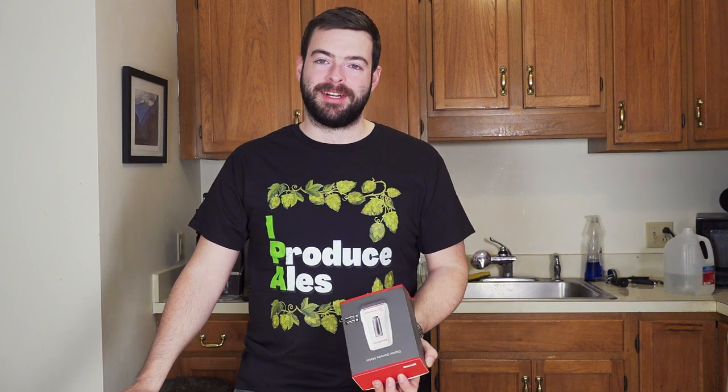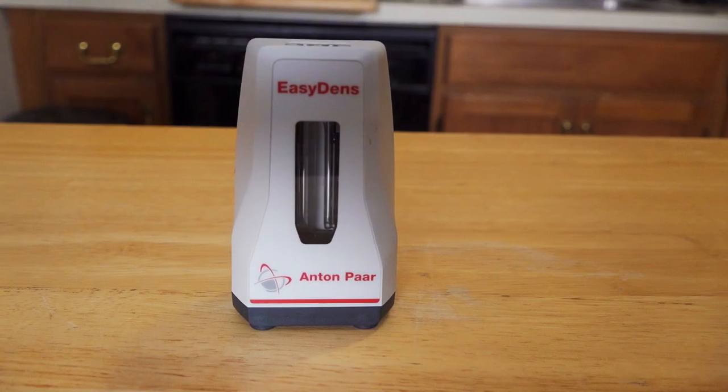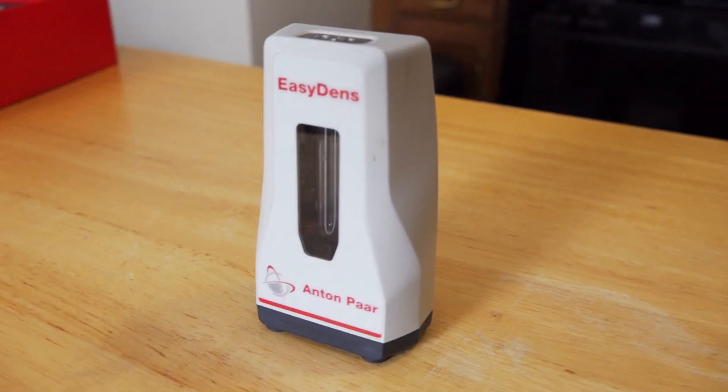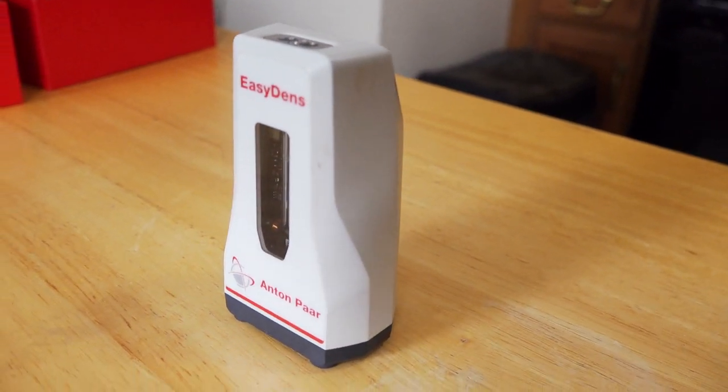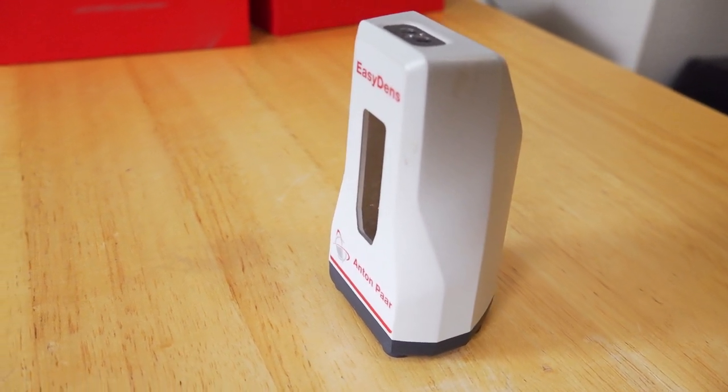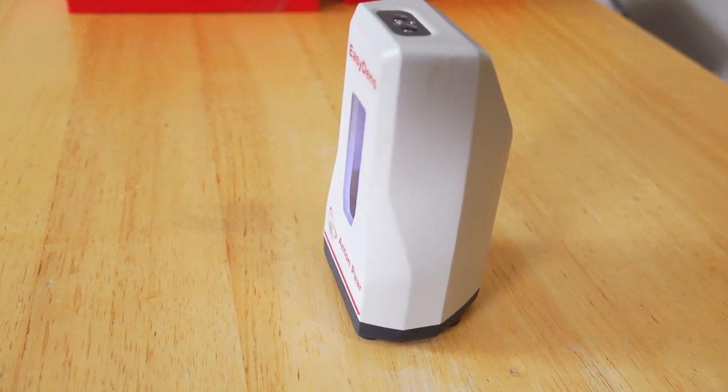Unfortunately, because of that, this is not exactly a cheap piece of equipment. It is a $350 hydrometer, which is a huge amount of money for what it does. But I think a lot of that cost is coming from the lab-grade precision levels that they have in this piece of equipment — and it is not an exaggeration, lab-grade precision.